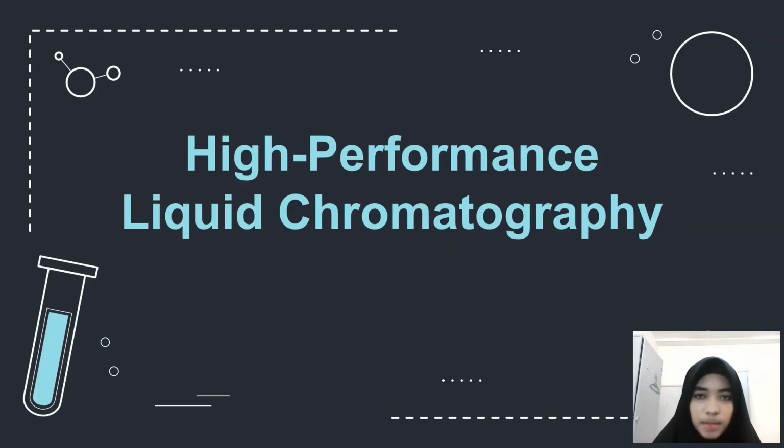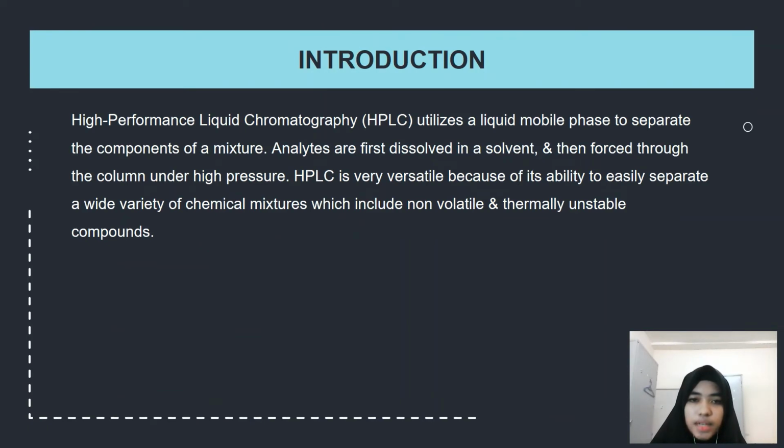Assalamualaikum. My name is Naaliba Azizi, and the next experiment is the determination of vanillin in vanilla essential oils by high-performance liquid chromatography. High-performance liquid chromatography (HPLC) utilizes a liquid mobile phase to separate the components of a mixture.